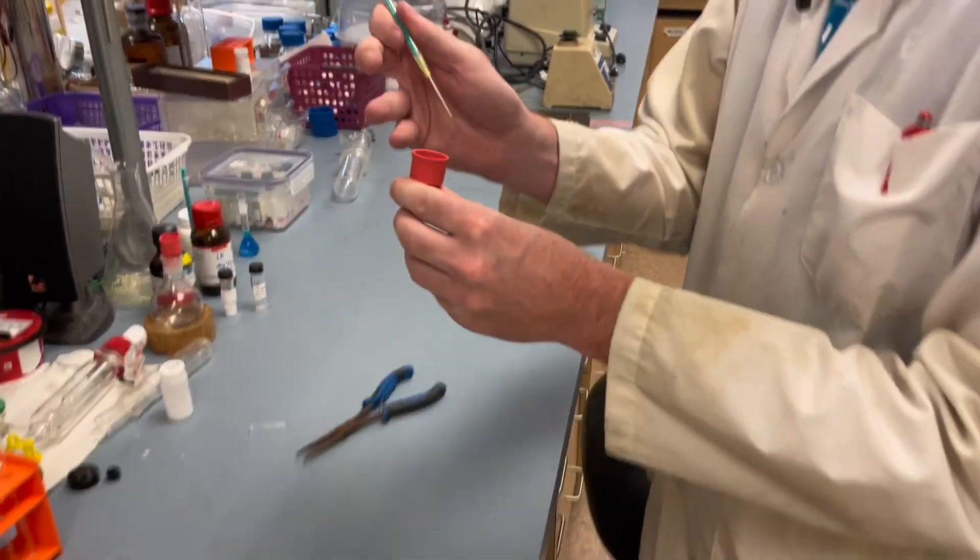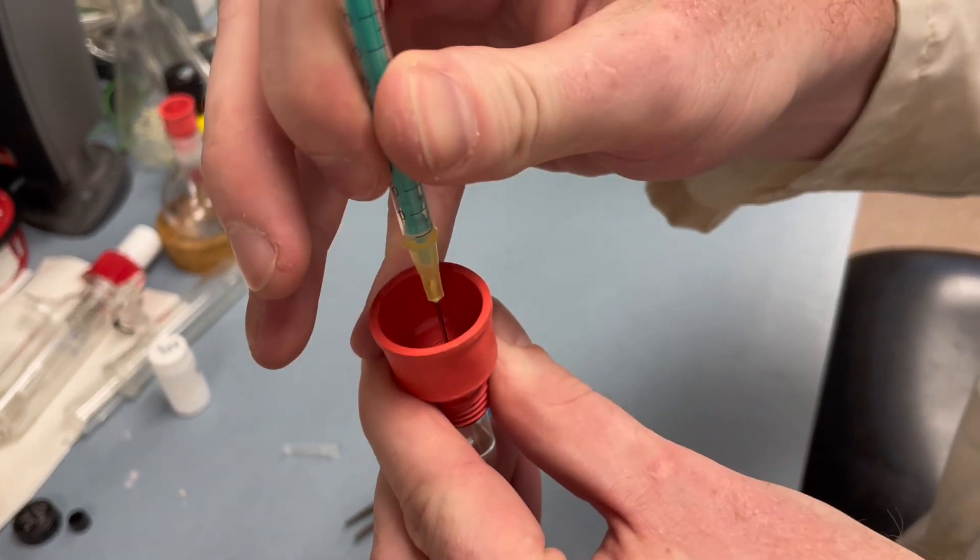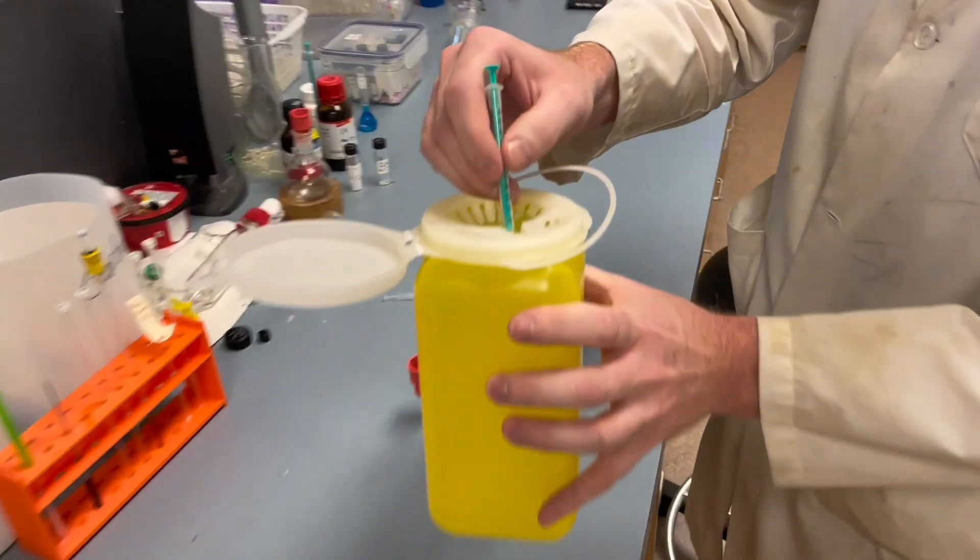Now what we'll do is we'll poke a hole through here which we can put our blunt tip needle through. Once we've done that we'll use again the sharps disposal container to safely remove this.